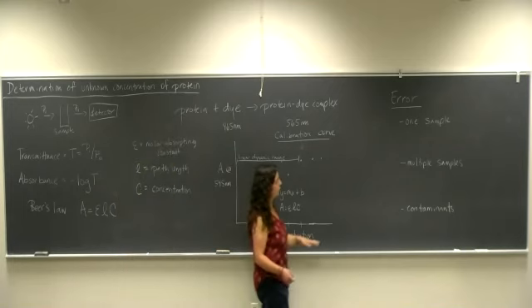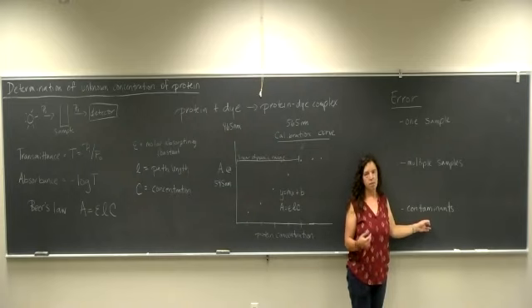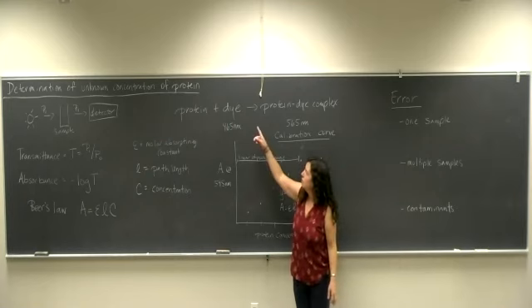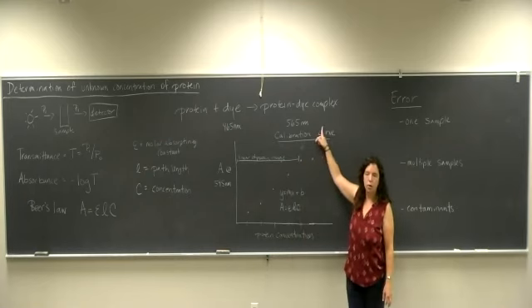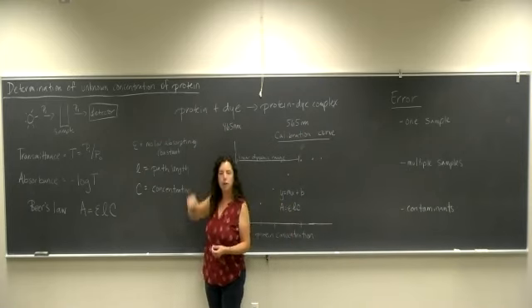So think about each of the things that you're putting in. Does it make the protein side chains more available? Is it reacting with the dye, which could then affect the resultant protein dye complex and give you maybe an inaccurate concentration?